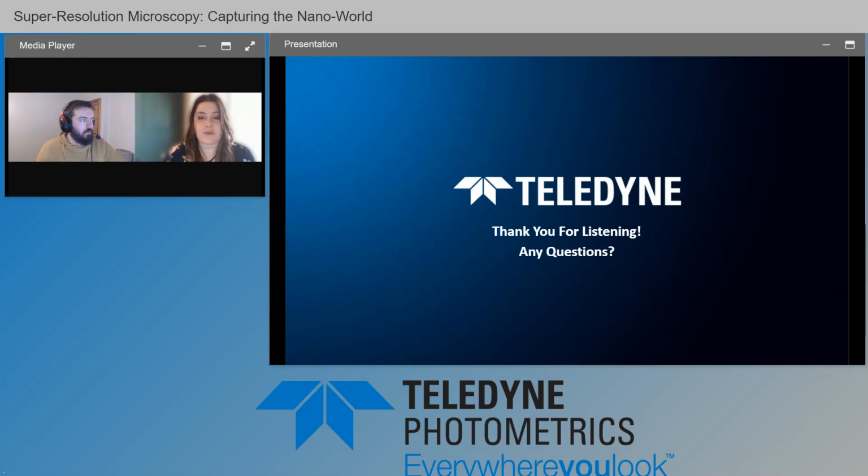Our first question asks, are there turnkey sub-assemblies available for techniques such as STORM that can be added to standard wide field or confocal microscopes? Great question. Essentially, you can convert some microscopes to microscopes that are capable of super resolution imaging if it's a kind of super resolution imaging that you just benefit from by changing the way that the light path works.